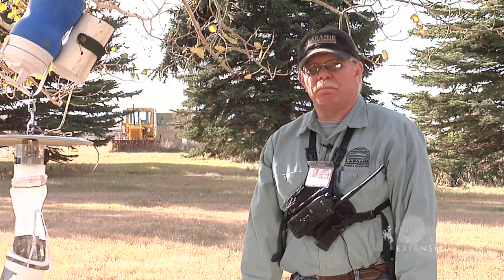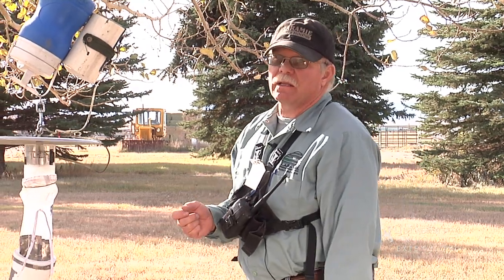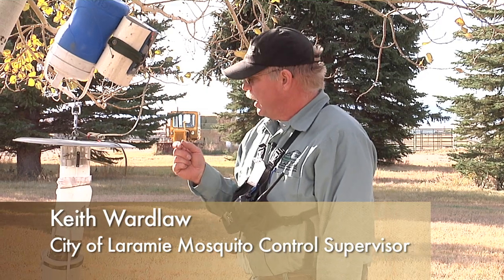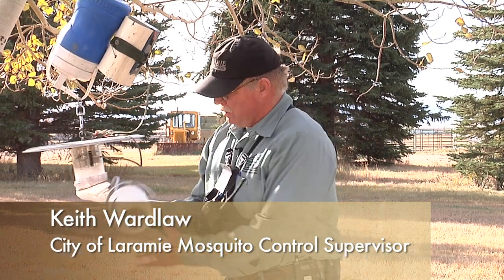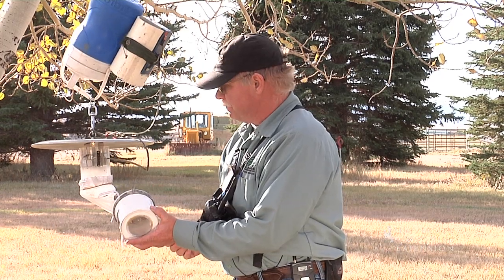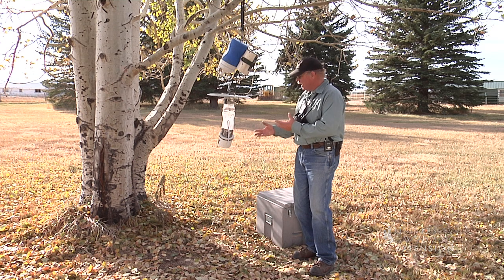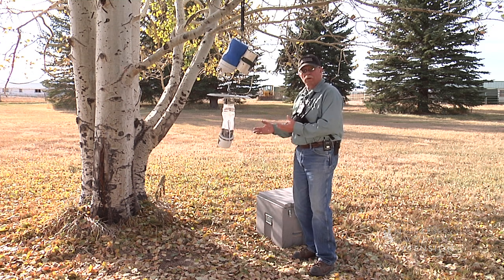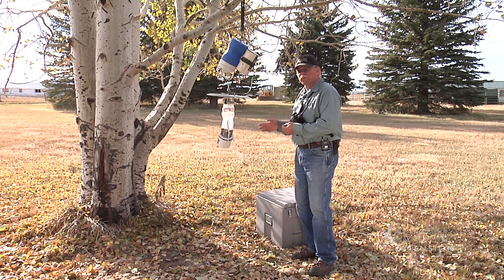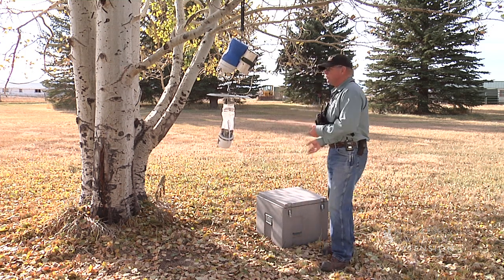We're back at the trap site 12 hours later. The trap has been out all night collecting mosquitoes, the dry ice is pretty well expended, and we've got numerous vector mosquitoes collected. The question is how do we get them back to the lab safely so that we can have good specimens to work with under a microscope and for virus testing.